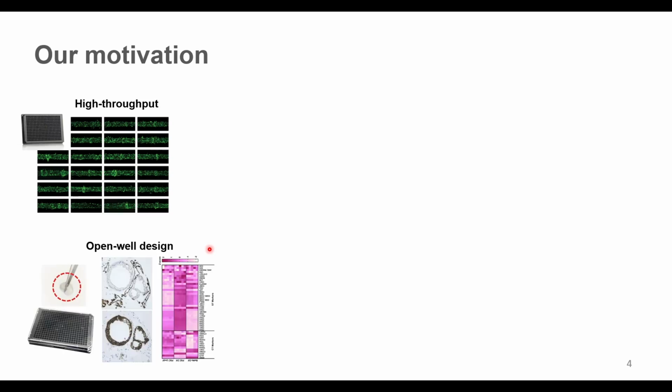And we also want our platform to have this open well design so we can easily extract the tissue that we built from the system for downstream analysis, like histology or gene sequencing. We basically want to be able to treat the tissue we built like real human tissue biopsies.